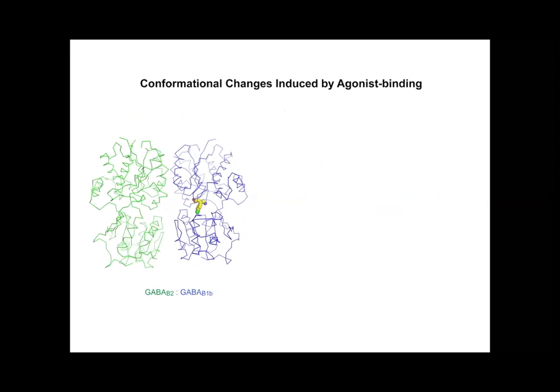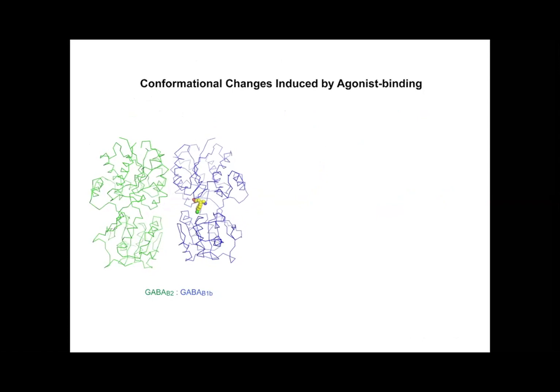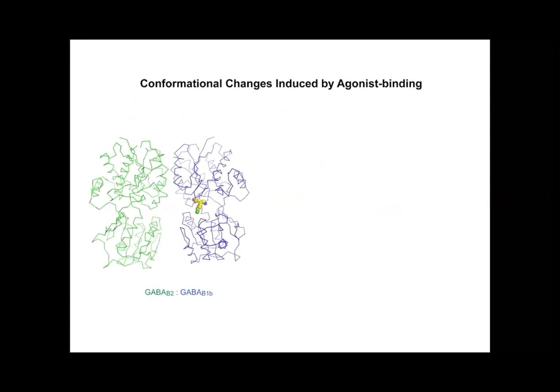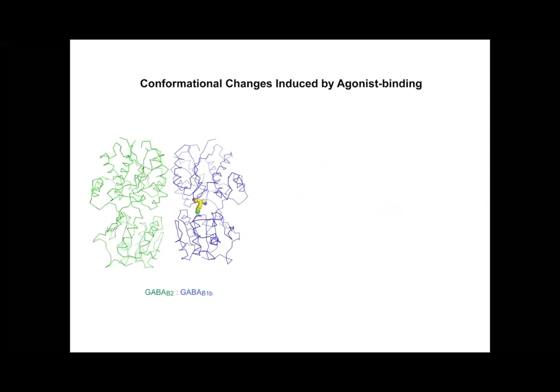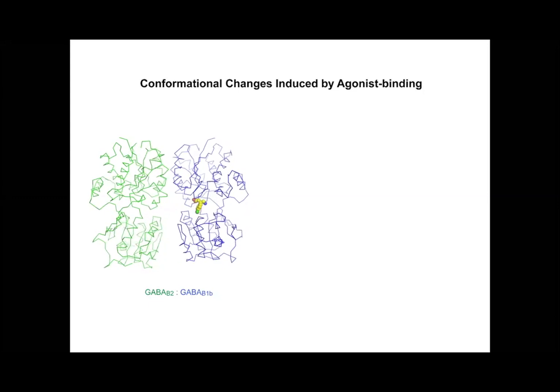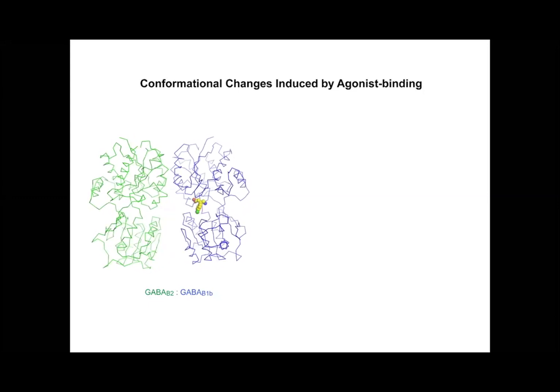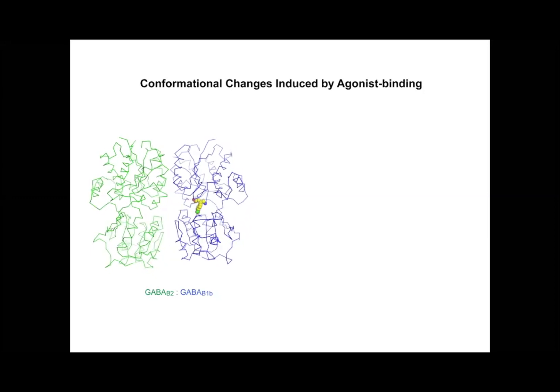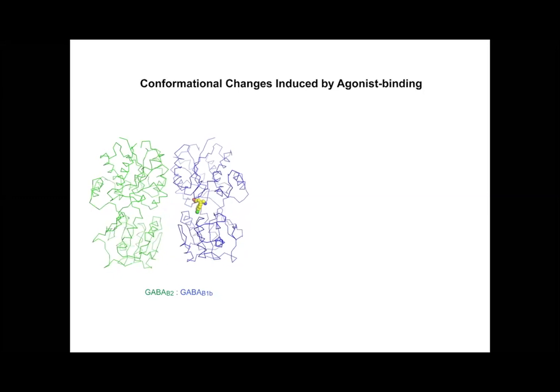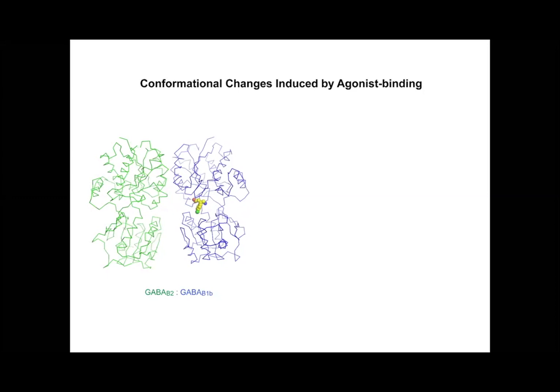This animation illustrates the conformational changes associated with agonist binding. First, agonist induces domain closure of GABAB1. Second, GABAB2 remains open, indicating that it has a constitutively open conformation. Third, the LB2 domains of both subunits undergo a twist motion such that they come into close proximity to form a large heterodimer interface that's unique to the active state.